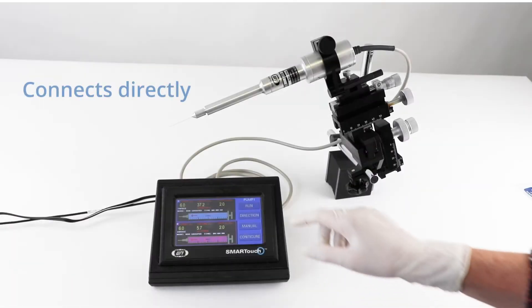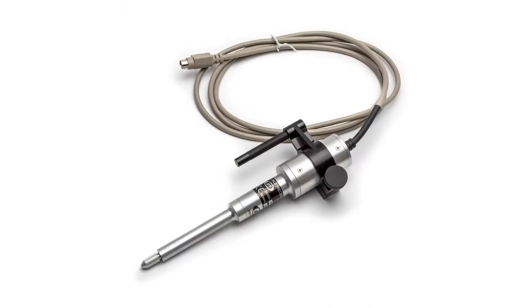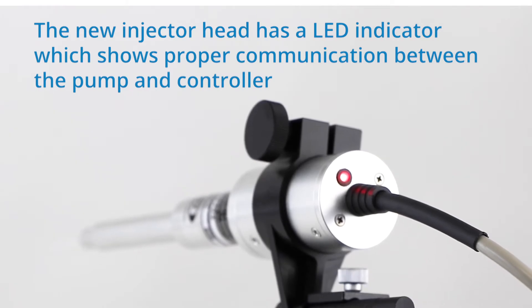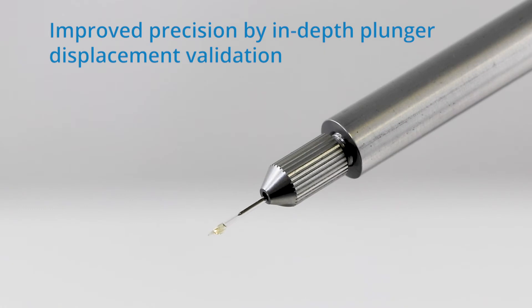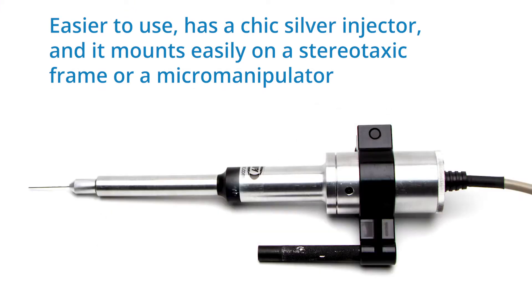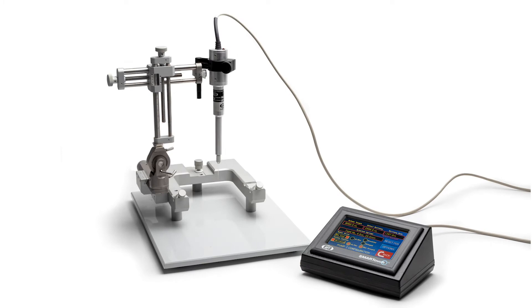The new model connects directly to the WPI Micro 2T smart touch controller. The new injector head has an LED indicator which shows proper communication between the pump and the controller. The Nanoliter 2020 offers improved precision by in-depth plunger displacement validation. The new system is easier to use, has a chic silver injector, and it mounts easily on a stereotaxic frame or micro manipulator.